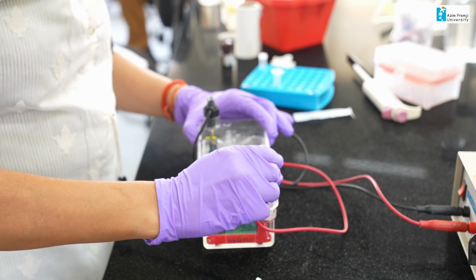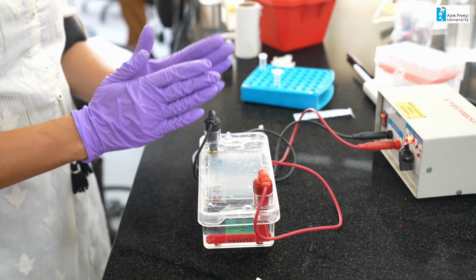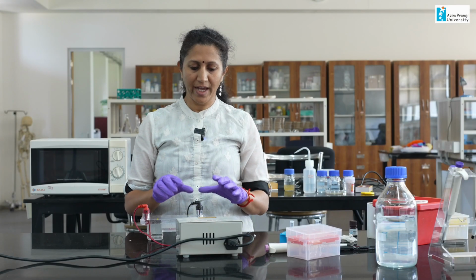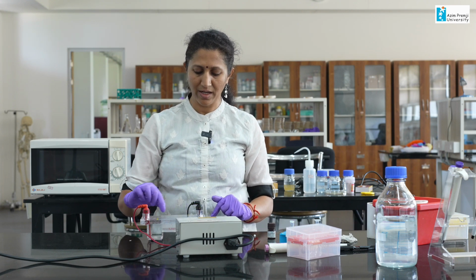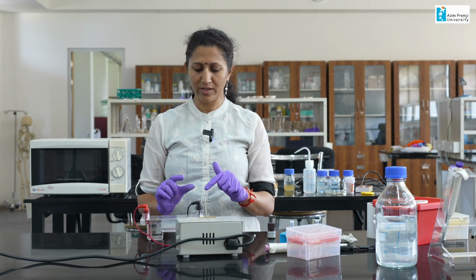I am going to connect the electrodes and turn on the power so that it starts running. Since I have loaded on the negative side, it starts running towards the positive side. The dye in the sample, which I previously mentioned as 5x gel loading dye, helps you to identify till where the DNA has run. You can see the color on the gel when it starts running, so based on that you can decide, okay, till here the DNA has run. Once it runs almost 3/4 of the gel, you turn it off and take the gel to the UV illuminator and check for the band.